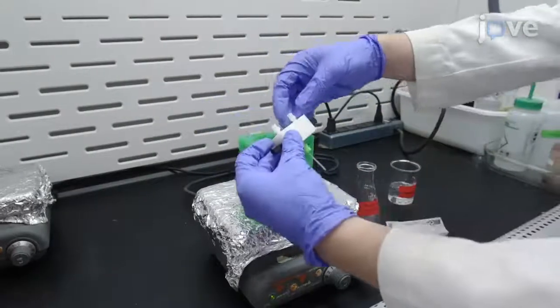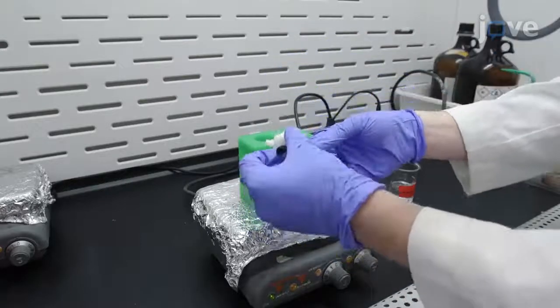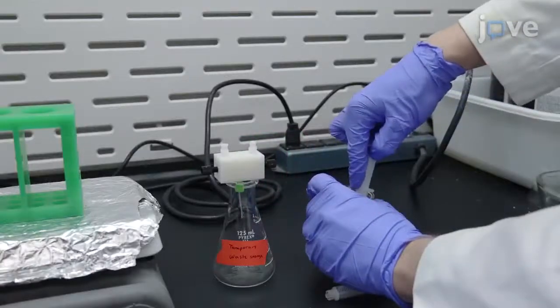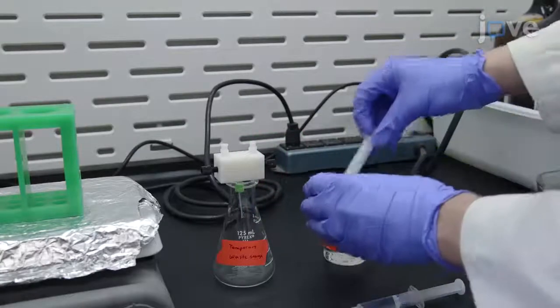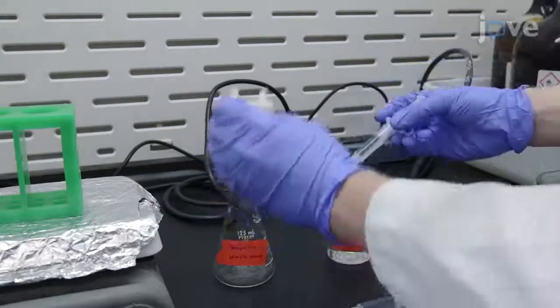Before starting the process, check the CIJ mixer fittings and ensure that the outlet tubing is not crimped. Then, fill two 5-milliliter polypropylene rubber-free luer-lock syringes with 2-3 milliliters of acetone or another cleaning solvent.